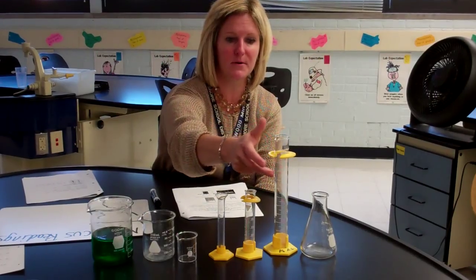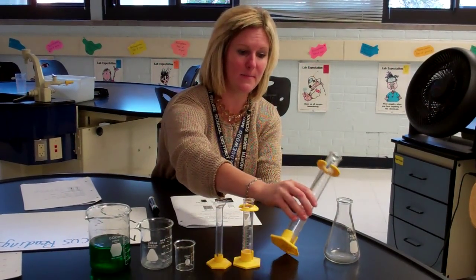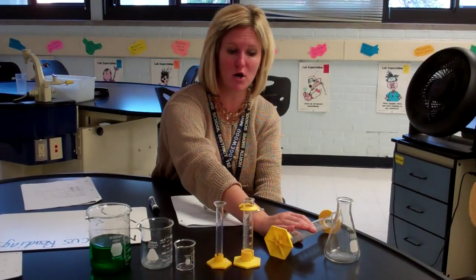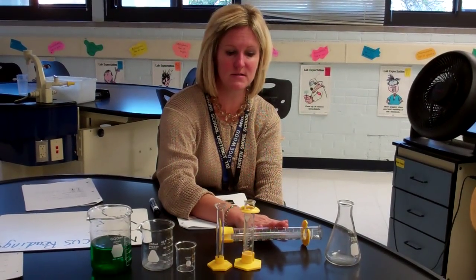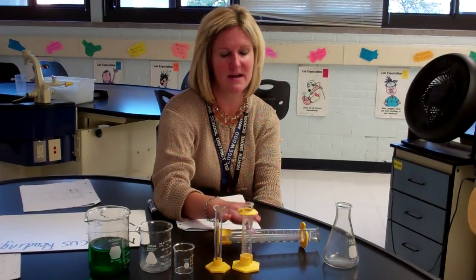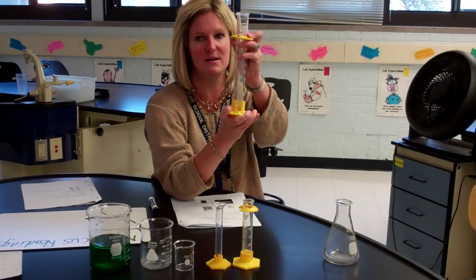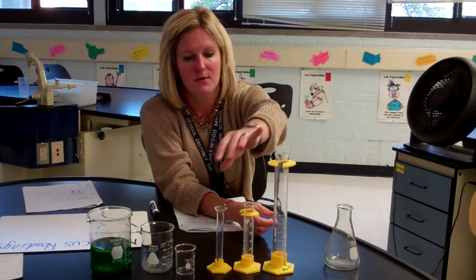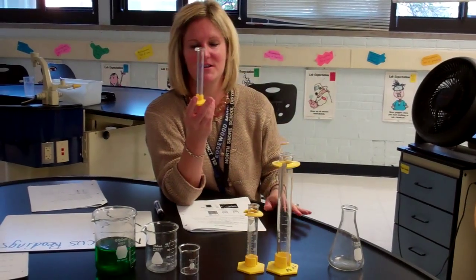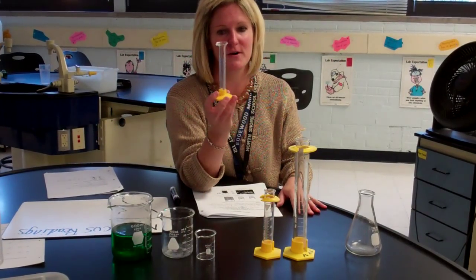Basically, the point of the bumper is, for instance, on accident, you may tip the graduated cylinder over, and the bumper catches on the surface so it doesn't break the glass. Sometimes it works and sometimes it doesn't. It is not used to go to the actual measurement as some people think it would, so we always keep it at the top. The reason this one does not have one is usually the bumper weighs more than the graduated cylinder, so it would just tip over.